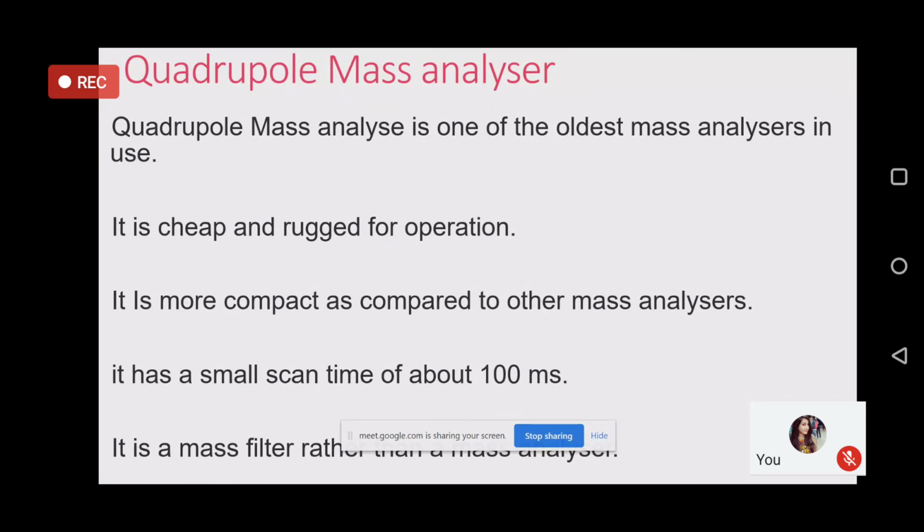Second important feature, I will read that screen afterwards. Listen to what I am talking. The second important feature is that the quadrupole mass analyzer is functioning as a filter. Its functioning is exactly like the functioning of a filter in an optical instrument. I think I explained this in the beginning. I vaguely remember having done this.